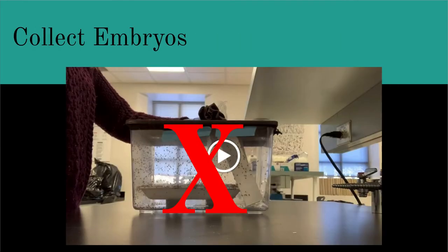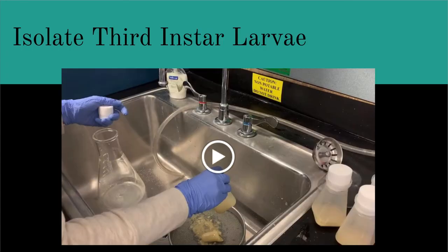This week in the lab, you won't be collecting embryos. It looks like our last embryo collection will probably be on Sunday, the 28th. So I'll go in and collect from all of the cages, and then I might leave them hanging out for a little bit longer just to make sure that we have enough larvae for all of the vials that are set up this week. You will be collecting third instar larvae from the bottles that are left out for your section, and these will be irradiated and you can put them into your vials.